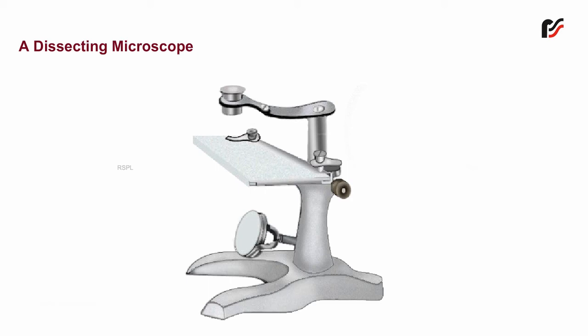The various parts of the dissecting microscope shown on your screen are: Folded arm — it is a horizontal arm attached to the vertical limb, which has the lens fitted at the other end.